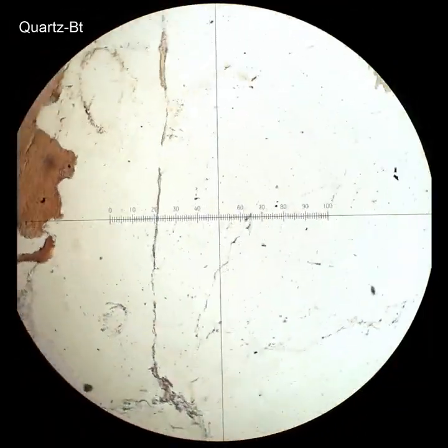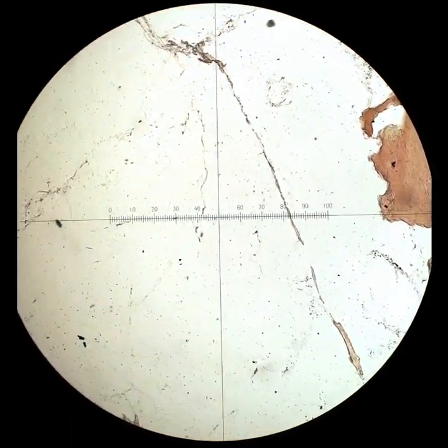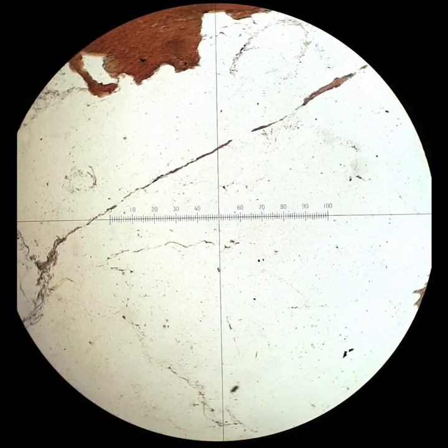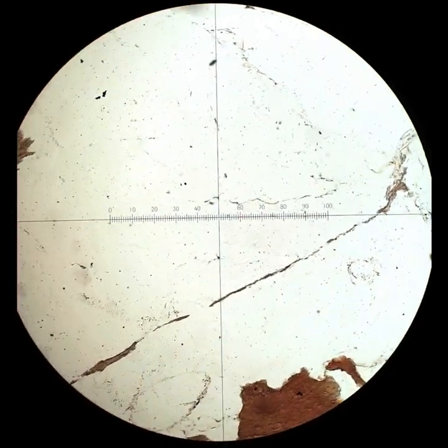So here, this quartz is more deformed. You can't tell that in plain polarized light. But when the polars are crossed, you'll be able to see there's lots and lots of different subgrain boundaries. And even those larger grains with the serrated edges have also started to break up into little subgrains.